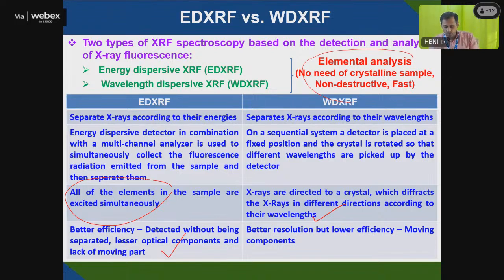You have two ways of EDAX analysis, like in SEM, scanning electron microscope, or TEM, transmission electron microscope. There is also the EDAX analysis. EDAX is nothing but energy dispersive X-ray analysis that will separate each element energy-wise. So EDXRF is similar to that. So mainly we have covered these X-ray based techniques till today.